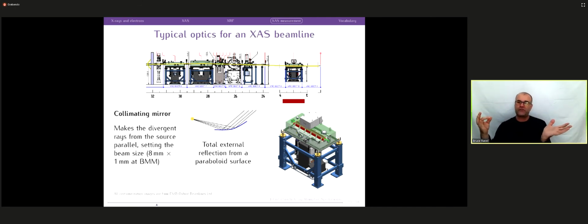If we take light from a source and hit a mirror that's in the shape of a paraboloid of rotation, then this thing that I've drawn sort of schematically, this drawing isn't very good, but it shows schematically how it works. If we come into the mirror from a source and bounce light off of the mirror, this diverging light off of this paraboloid, we end up with rays that are parallel coming off of the mirror. So we lose a little bit of flux by passing light over the mirror, but what we gain from using the collimating mirror is that instead of having the beam get bigger and bigger, the rays of X-rays are now parallel and go through the rest of the experiment, the rest of the photon delivery system, without diverging, but being parallel. So it lets us save a lot of flux by collimating the light.